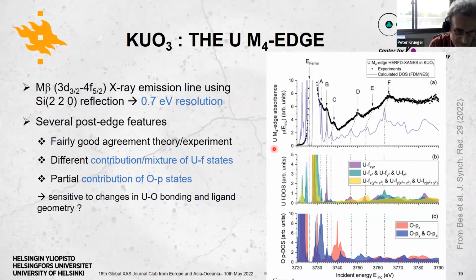And if you look at the peak positions here, you have some which are very good at the low energy part, and then it gets worse. There might be many reasons, as you said, also about the charge and so on, but I think this is rather common and not too much to worry about for the lattice parameter in my experience. Yeah, it's what I observed many times by calculating different compounds.